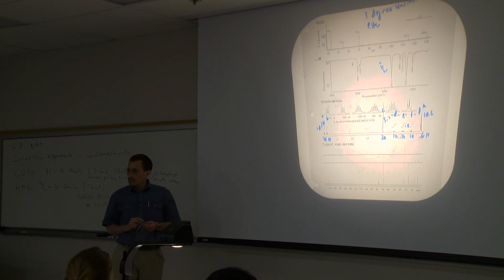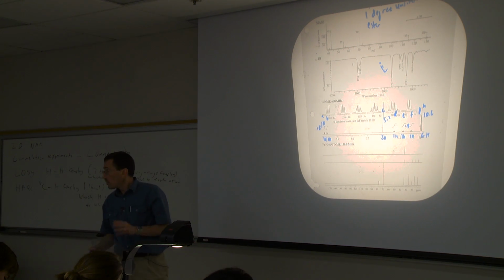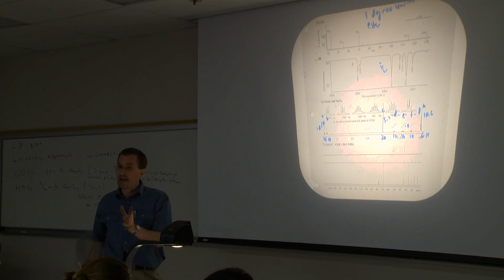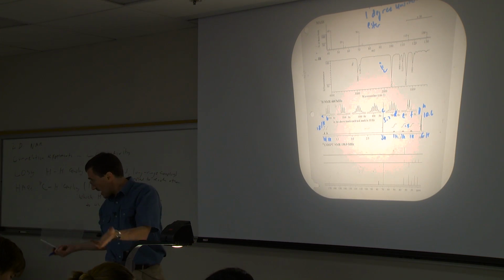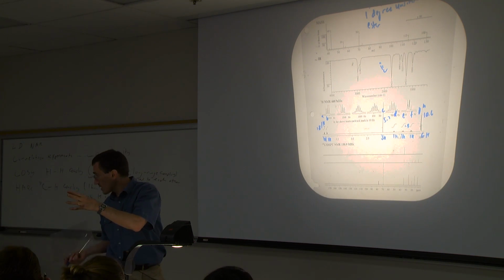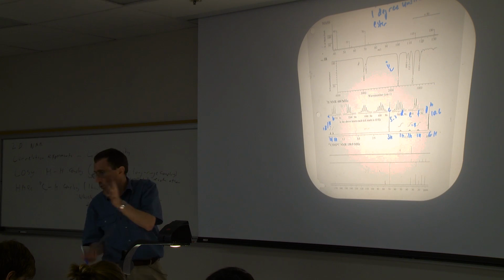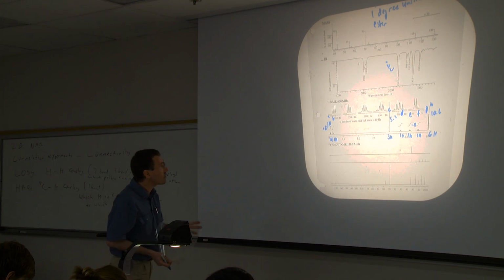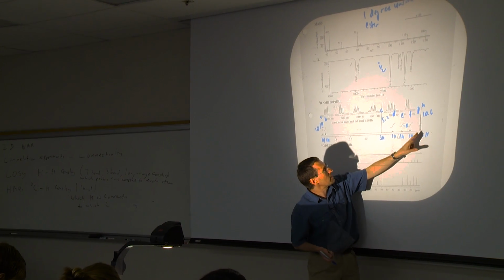Now, up until this point with NMR, we've been relying on pattern recognition, like the CH3 next to a CH2, where we see the triplet and the quartet and the ratio of integrals. So there are certainly things that we can pick up from pattern recognition here.